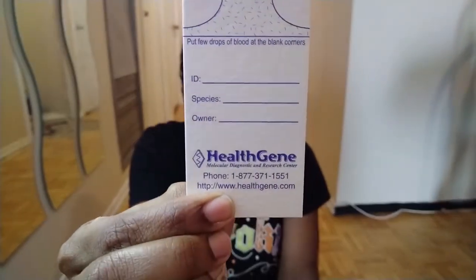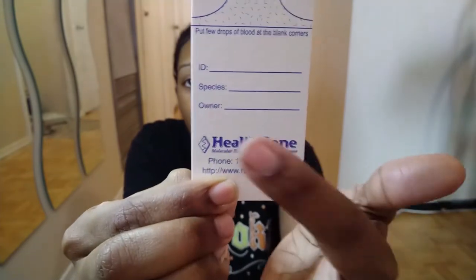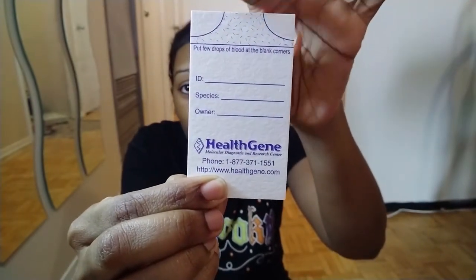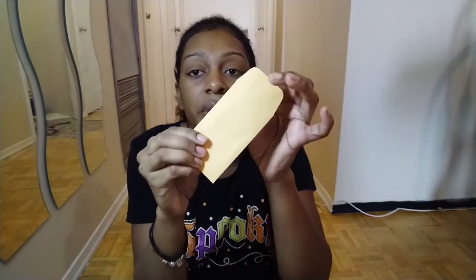All you do is write the parrot's ID — like the band, if they're banded — the species, and of course your name. You put drops here; I think one gets one drop and one gets two drops, or a few drops, in each corner. You're going to put it back in this envelope once it's dry — you have to leave it for 20 minutes to let it dry. Put it back in the envelope, lock it, put the envelope in here with your information, and then mail it off.